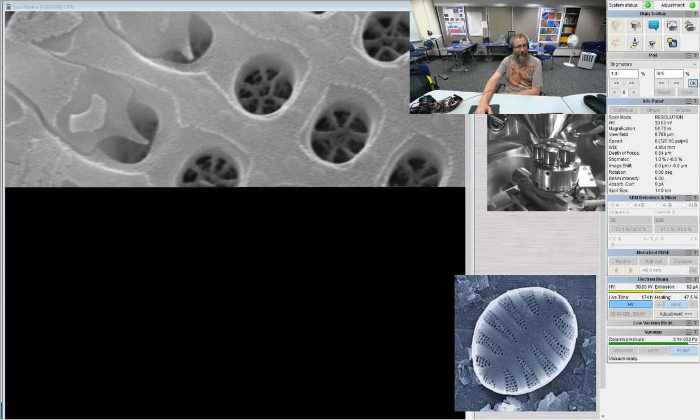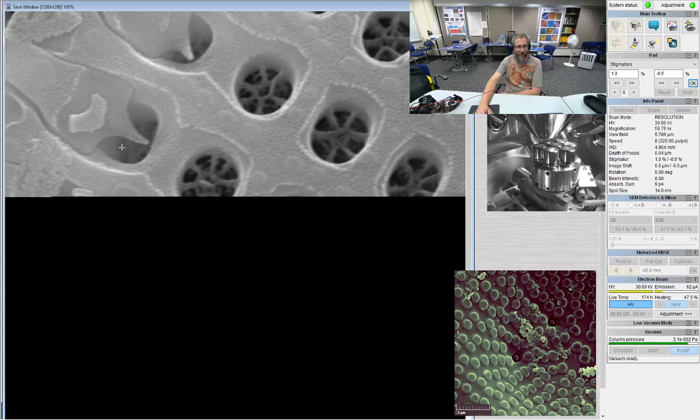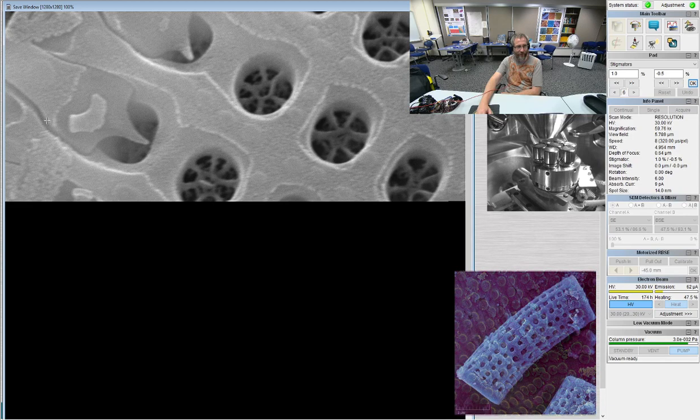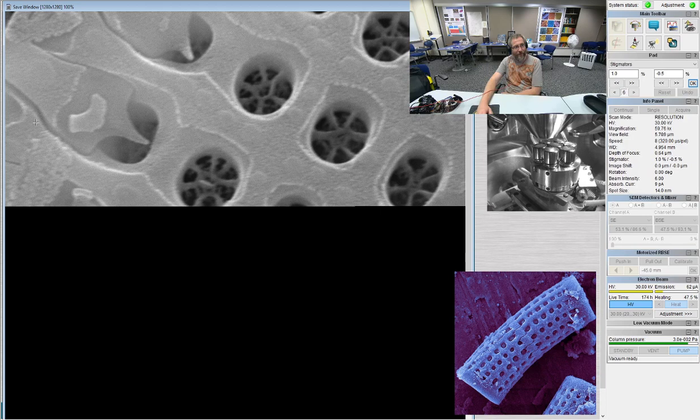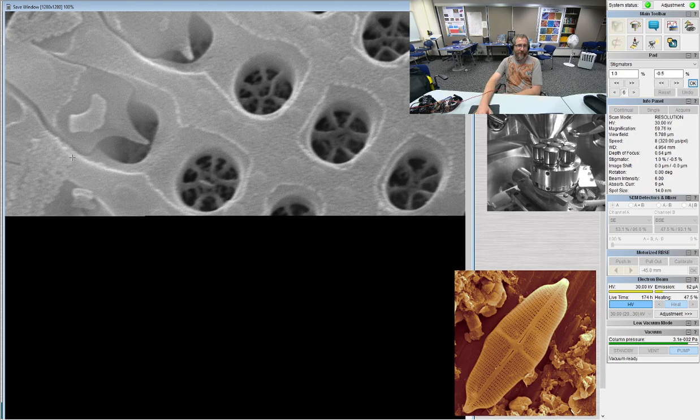So I just realized that the far left two areolae on there are half covered by the spines from the other valve. Correct. This is the spine cover, and this is the shape of it. It's very, very much like a chess queen head. Right? Yeah. And then it actually has like a little inset groove. Man, that's a pretty good reason to name a diatom, right? Yeah. Chess Queen probably has a direct Latin.